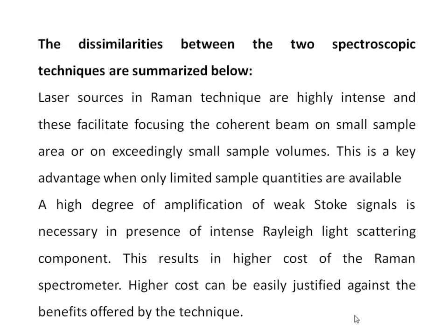High degree of amplification of weak Stokes signals is necessary in the presence of intense Rayleigh light scattering. This results in higher cost of the Raman spectrometer. This higher cost may be justified against the benefits offered by the technique.